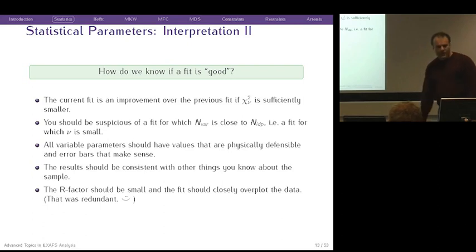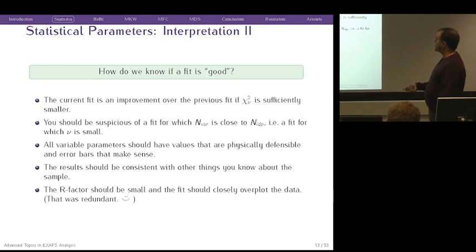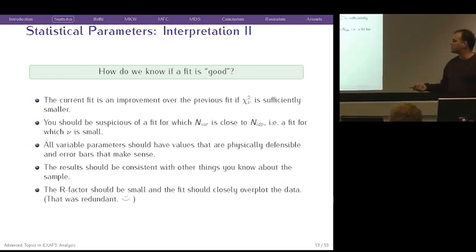You should be suspicious of a fit for which the number of variables is very close to the number of independent points. That is, a fit for which nu is very small.